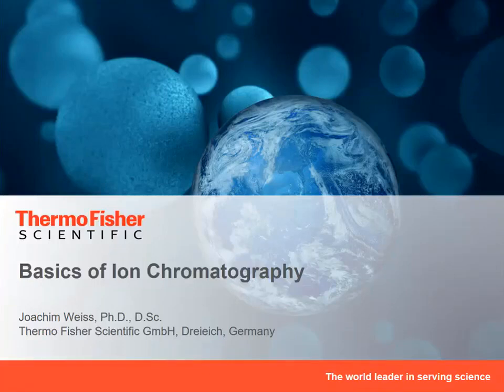My name is Joachim Weiss, and in this presentation I will guide you through the basics of ion chromatography.